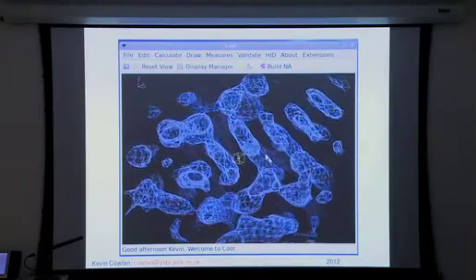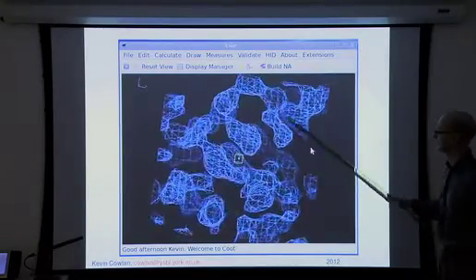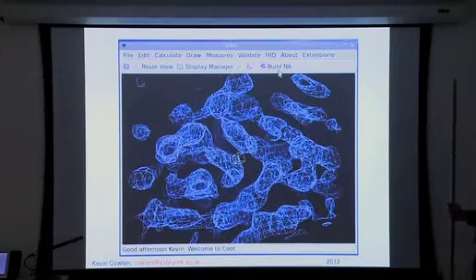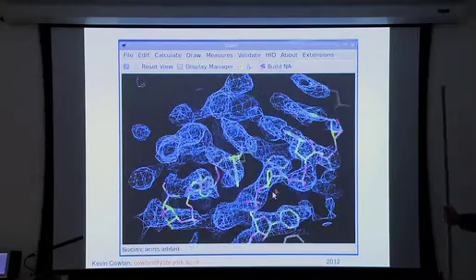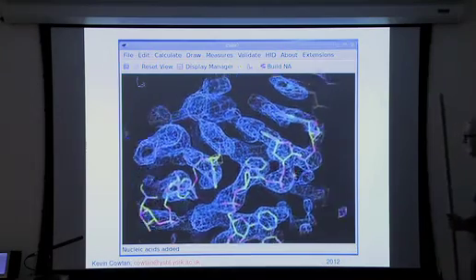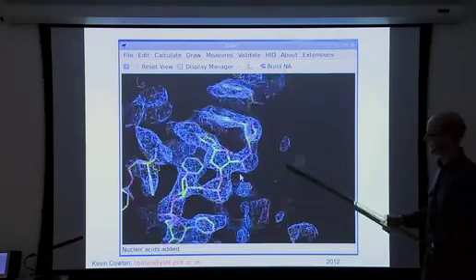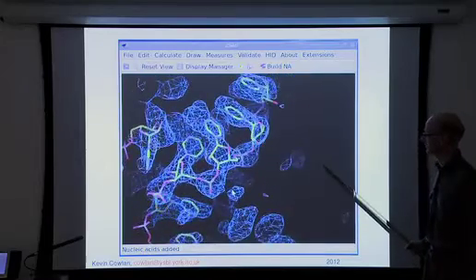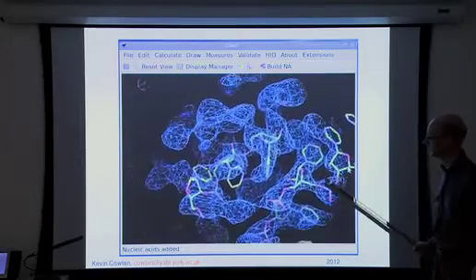Here's an example of the Coot version. So here we've got some bases stacked, and what we'll do is we'll just click the build nucleic acid button and ping. There it was. Okay, so here it's done clearly a pretty nice job. It hasn't assigned the base types. For that, you need the offline version.